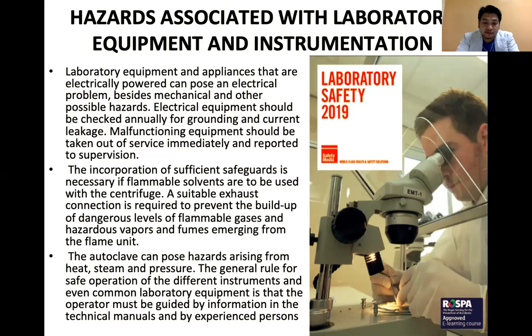Also, autoclave. Autoclave glass can pose hazards arising from heat, steam, and pressure. So we have experienced during internship class now, the interns did not close properly yung lid ng autoclave.